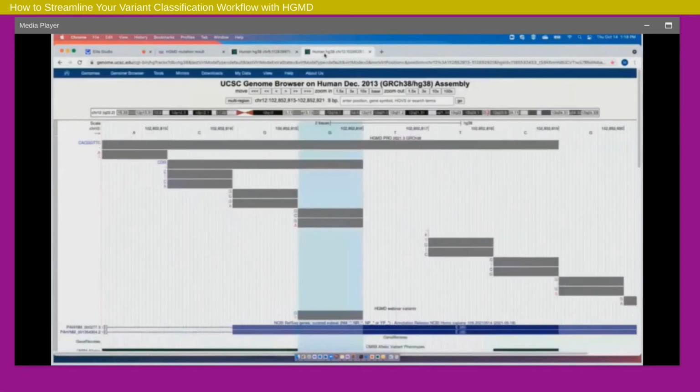Another use case for having this information in this visual format is if you're doing variant classification according to ACMG guidelines. One piece of information or evidence, here I have my variant of interest in the gene PAH, which is a G to T. I can quickly see that at this same location, there have been disease mutations reported in HGMD for G to C and G to A.